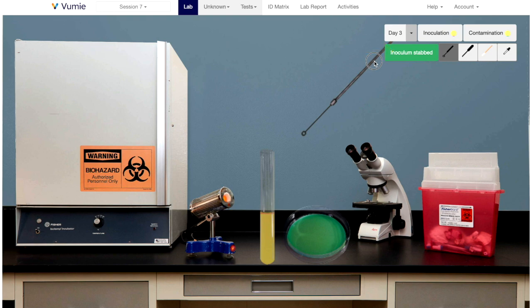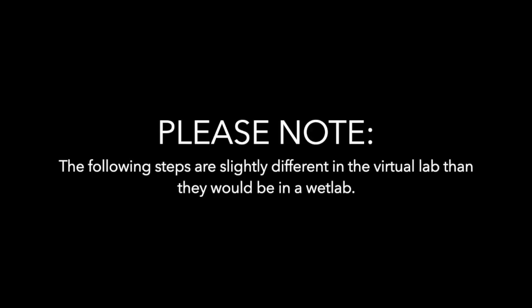You must enter and leave the tube through its mouth. Please note, our virtual lab deviates somewhat in the following steps from actual tube to plate transfers in a wet lab.